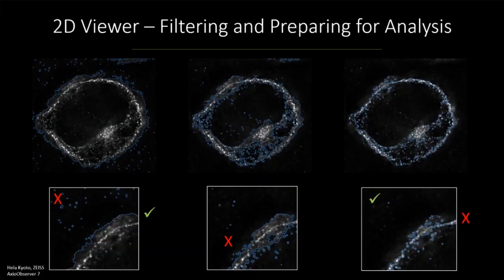Here's something a bit more advanced. Here's a case where we have objects in a cell, and these objects are associated with the cytoskeleton of the cell. We may want to grab the cell, because we want to begin to compute the number of things in the cell. So we want to understand cell-by-cell phenomena.